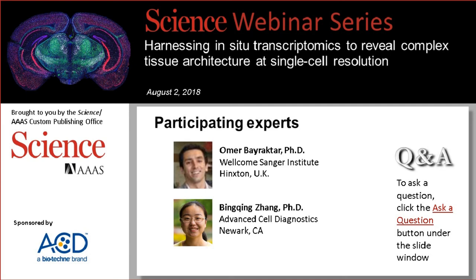Yes, that's a great question. So currently a direct comparison is lacking, since both LastMap and StarMap are brand new methods. We have not been able to do the side-by-side comparison on the same tissue in the same lab. But in terms of their multiplexing, currently our approach is restricted to 4 genes, while StarMap is focused on higher multiplexing, from 16 to 160 to 1,000 genes.